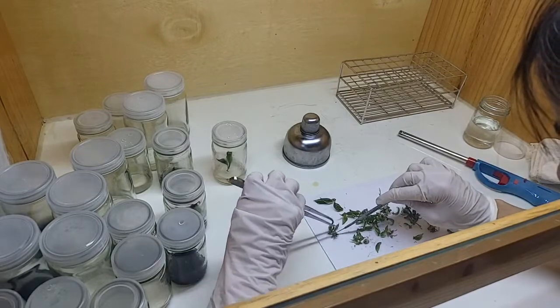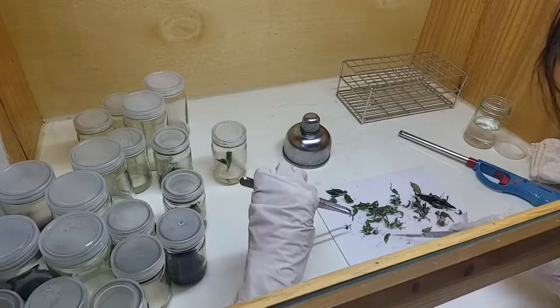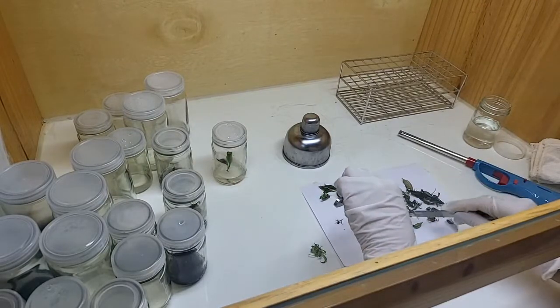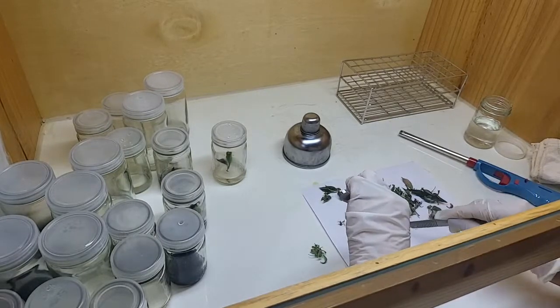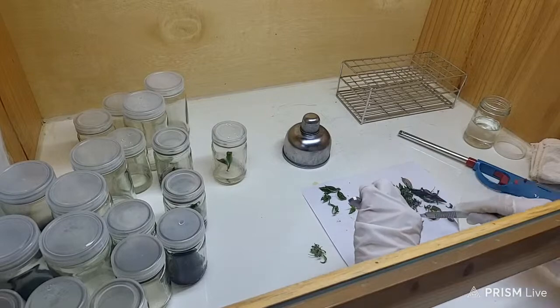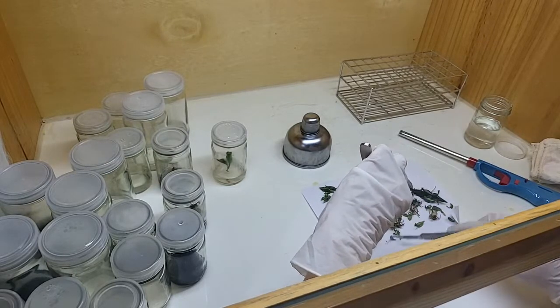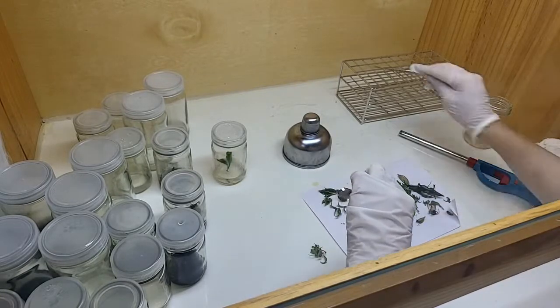That paper you're seeing over there is actually normal ordinary paper that has been sterilized in the autoclave. All the equipment has been sterilized. You see that little clump that has fallen off the paper — that piece we're not going to use; we rule it out as it might get contaminated. This laminar flow is not autoclaved; we only sprayed it with alcohol and used UV light, but it's not sterilized with pressure and heat. Those clumps are going outside to the nursery to get acclimatized later.